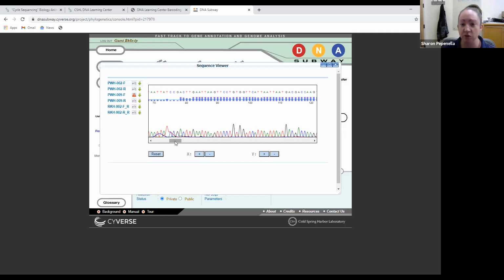If it's assigned a score of 10, what it's telling you is that 1 out of every 10 nucleotides is a potential misincorporation, or it's potentially incorrect, okay? If it's a score of 20, this is an exponential increase. So instead of 1 out of every 10, 1 out of every 100 nucleotides could be base call wrong. If it's assigned a score of 30, then 1 out of every 1,000 nucleotides has a potential for being miscalled. Now 20 is our cutoff, so that's the threshold here. So anything above 20, so 30, 40, 50, is considered by the software relatively good, relatively high quality.